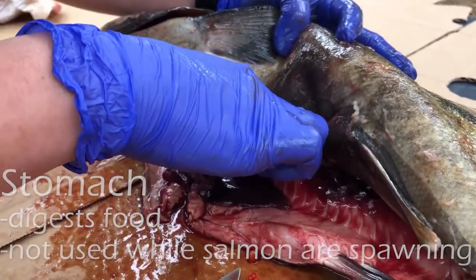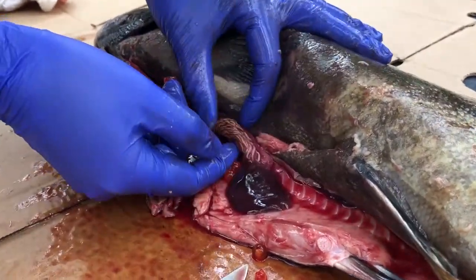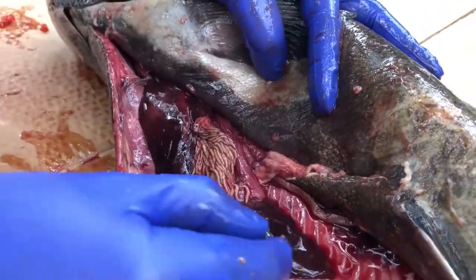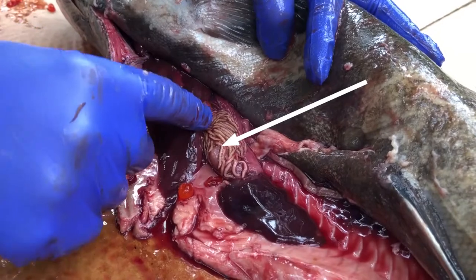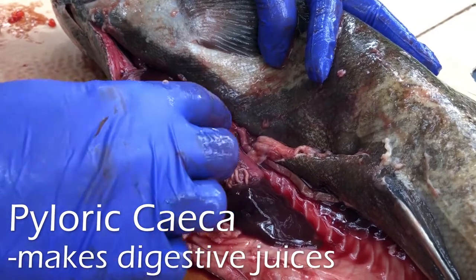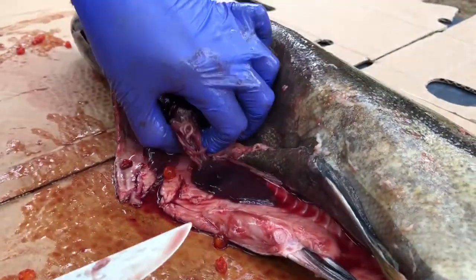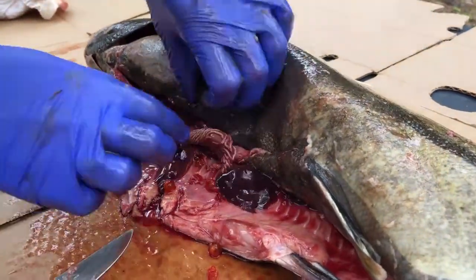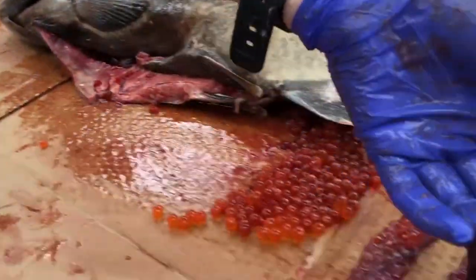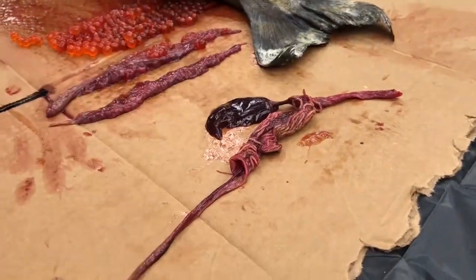This stomach is empty. This weird spaghetti-looking thing — you might also hear it referred to as finger-like appendages — is called the pyloric ceca. Those finger-like appendages bring a lot of surface area to help with stomach digestion. I'm going to cut the stomach and the whole digestive system out of here. Here is the digestive system: we've got the stomach, the pyloric ceca, the spleen, and then part of the intestine right there.